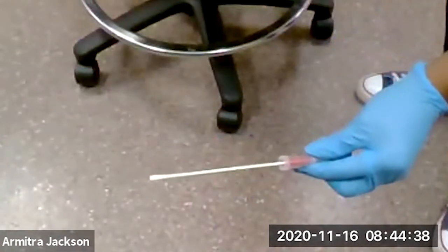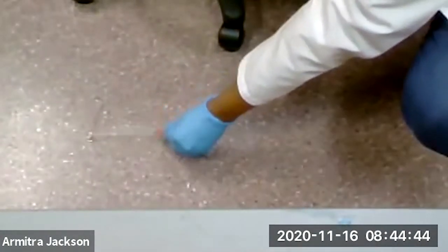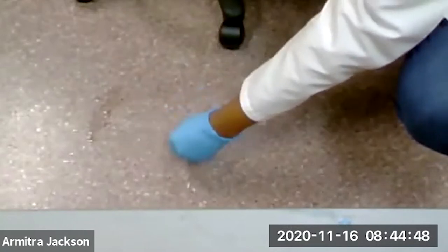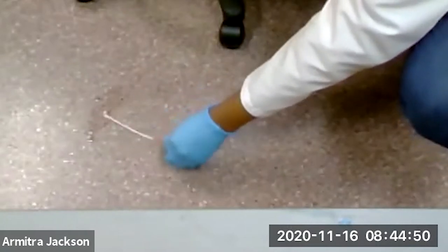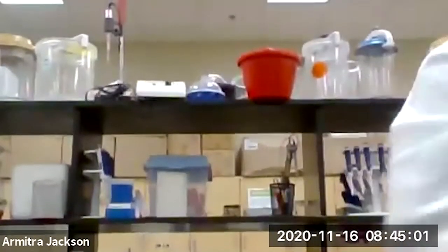You can see the swab here. We're going to sample this area right here. You can see we're getting it, turning it around real good. Next we are going to take our swab and put it back in its container.